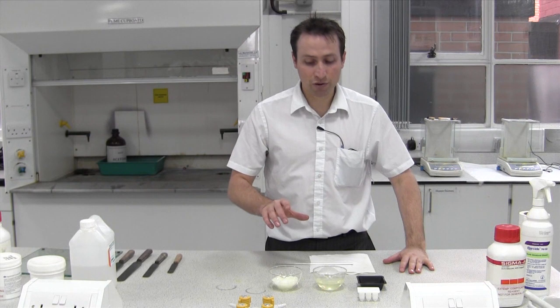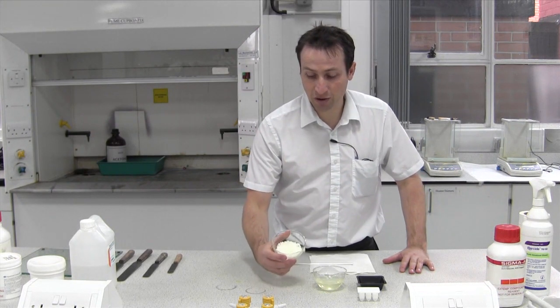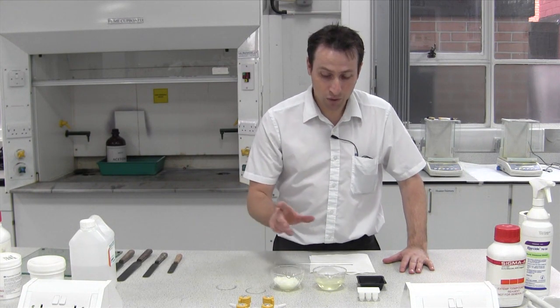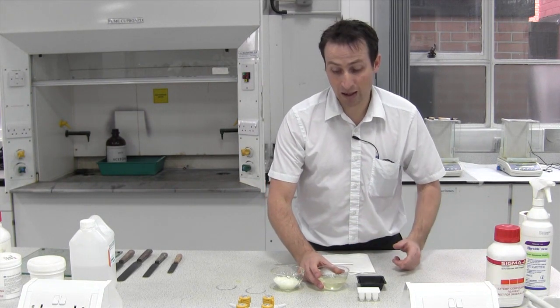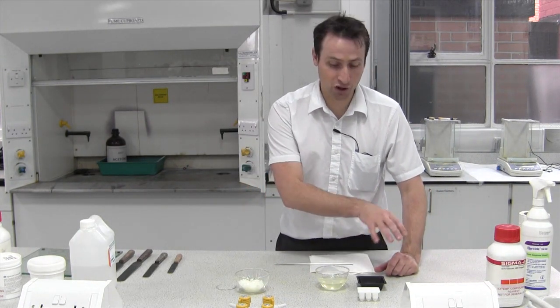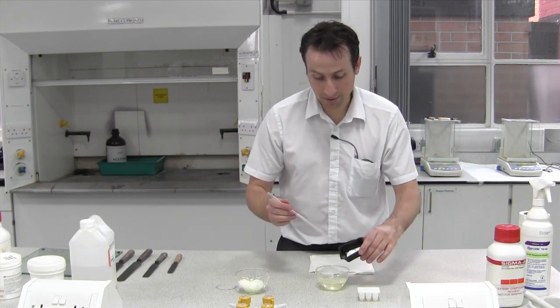We're going to look at making a suppository. To do that, first we need the suppository base, which here we have in granular form. It should melt using indirect heat on a water bath, which would produce a liquid like this. What we're going to do is incorporate the powder we've already weighed, measured and checked, and stir that in with a glass rod in this receptacle.